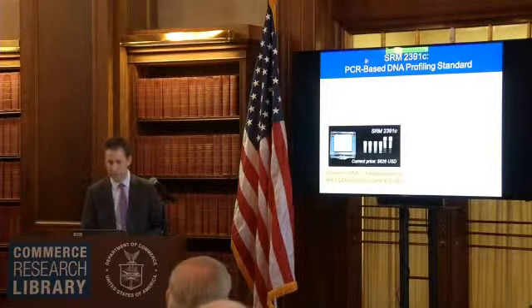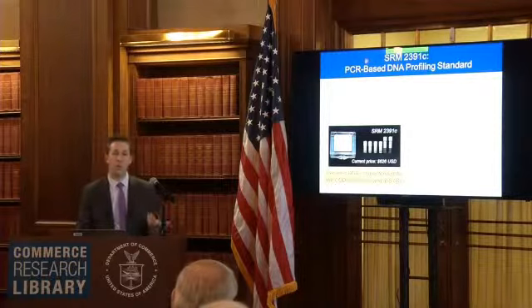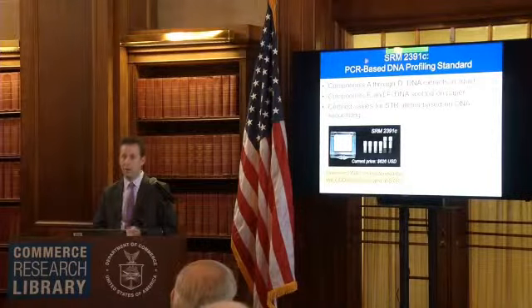So this is what the reference material looks like. This is 2391C. There's 6 vials. And these are characterized, these have been typed and sequenced for those core markers that I've been talking about previously. So there's components A through F, and A through D are DNA samples.